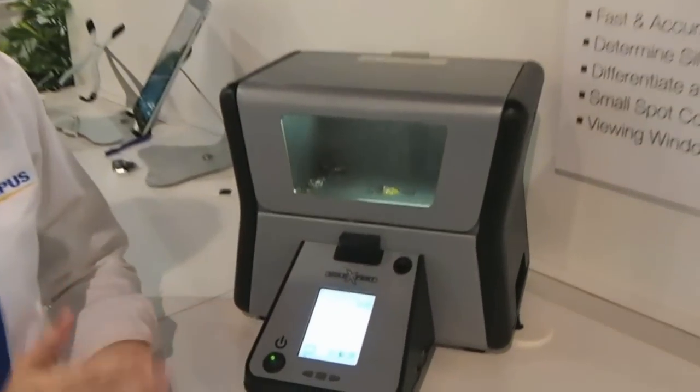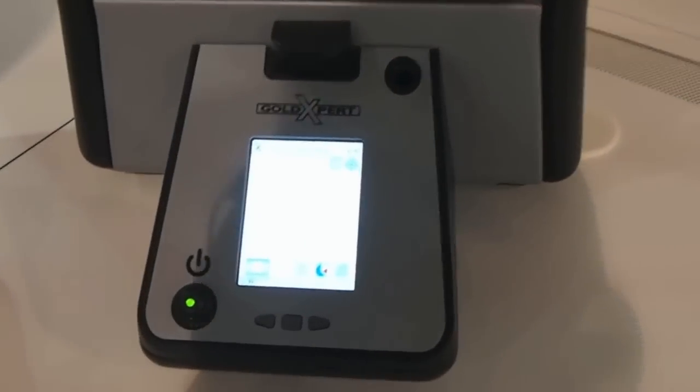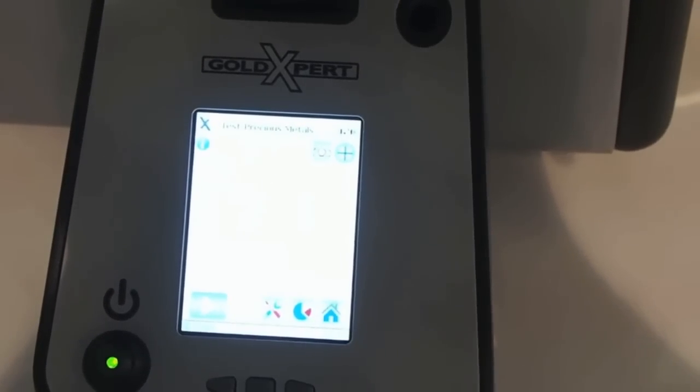You can see I'm performing a measurement right now, and it shows that this is a silver chain. It's confirming the metal as opposed to a stainless steel or something that's not a precious metal.